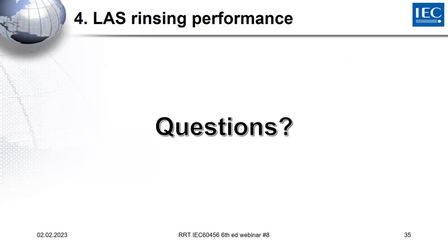Yeah, Ralph here. I have no question, but I have a comment on the statement already from Markus regarding the preparation of the test water, the distilled water. If you are using an ionic exchanger, we are using a double system with two systems in serial. If this device is not used for a longer time, you should rinse it out enough that the water is clear, because in the beginning you will not match the requirements of the standard, and then you think maybe this device is not working. So rinsing of the device is very important.